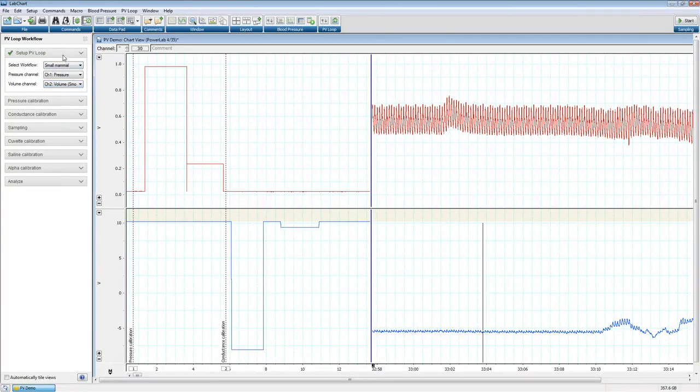So the first step, always, it's set out for you here. This is what you need to do first. Of course, we would have the MPVS software open right now. I won't cover the MPVS software during this presentation. We do have a webinar out there that talks about it and how to use it. I'll just mention it briefly, but if you do want to learn more about how to use the MPVS software, definitely look at that webinar or give me a call.